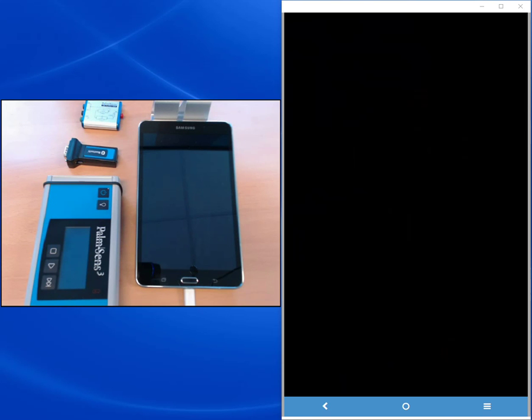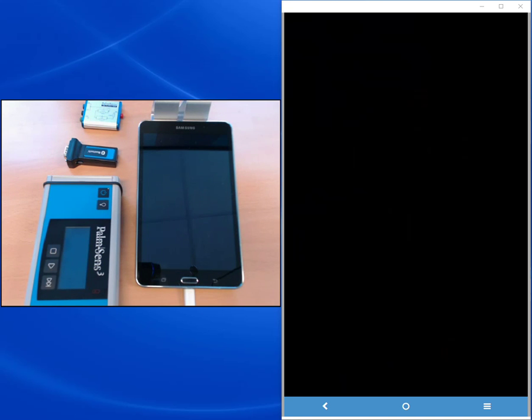Welcome to our second PS-Touch tutorial. This time we're going to measure electrochemical impedance spectroscopy and look at how the data is plotted in PS-Touch.